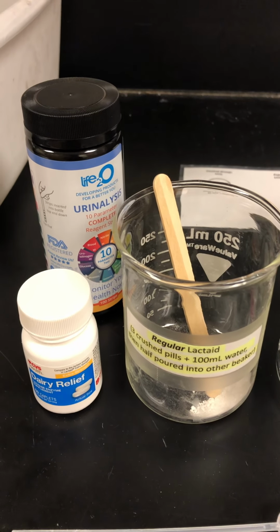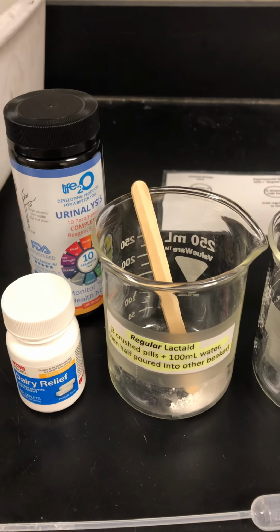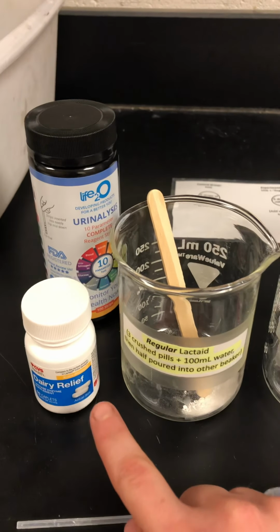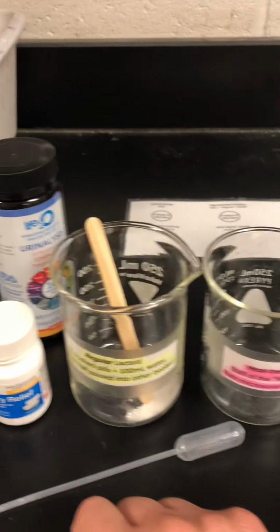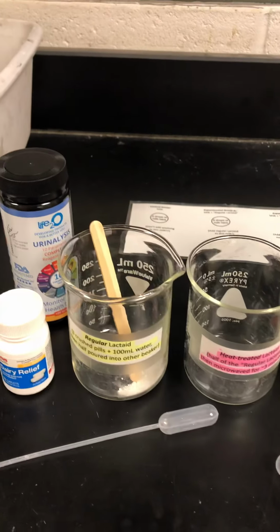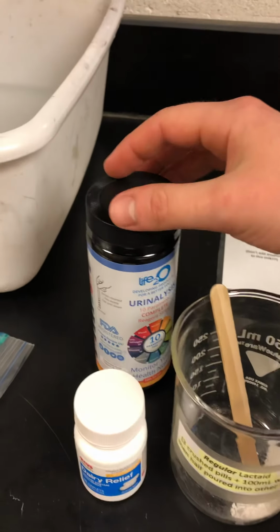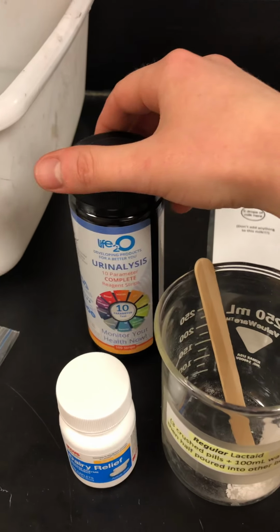This video shows how to set up the Lactaid lab. So we're going to need dairy relief pills, and the brand name is Lactaid. We're going to need some milk to digest with our Lactaid. And then we're going to need some urinalysis test strips that specifically test for glucose.